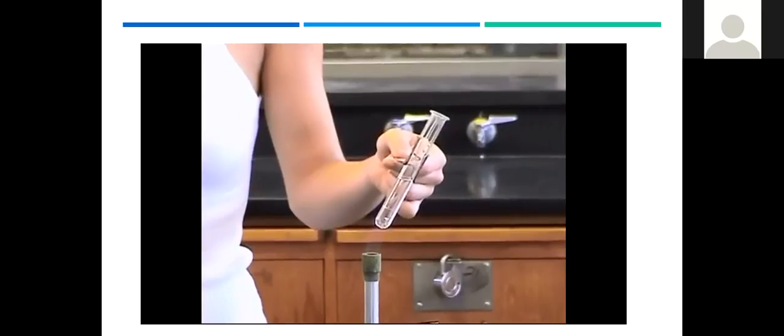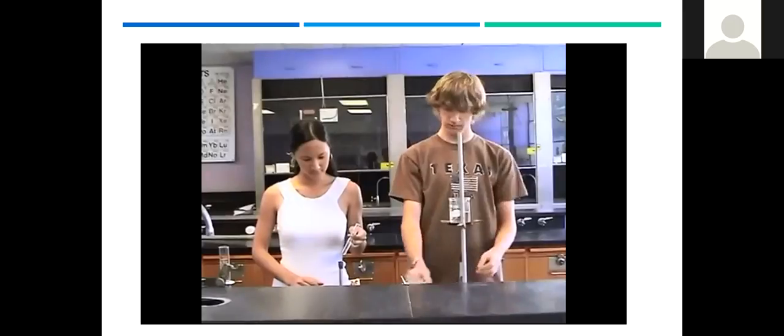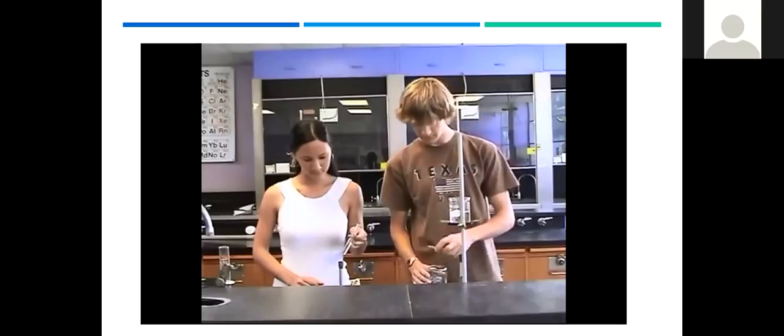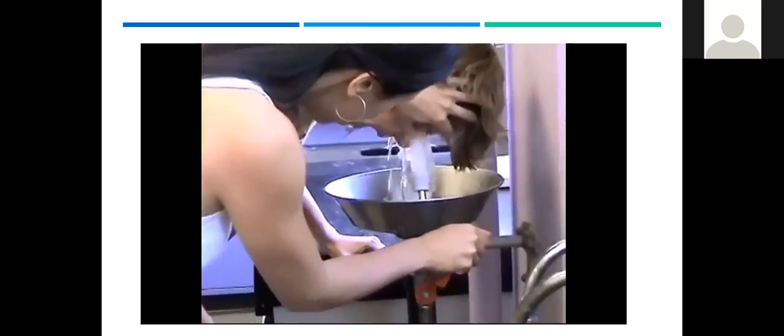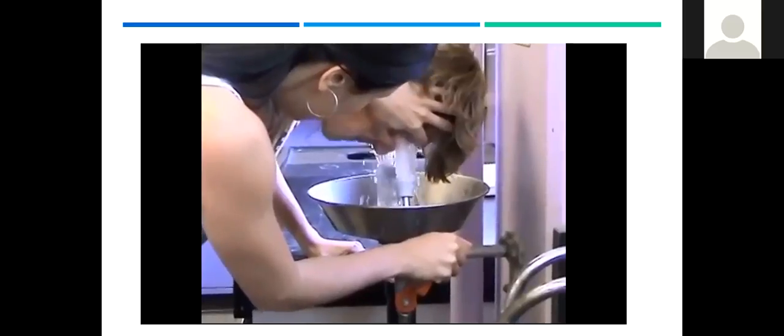Notice the student on the left is applying a strong flame to a test tube containing a liquid. Because the test tube is not being heated evenly and gently and is also being carelessly held, the contents can easily be bumped from the test tube, perhaps into a neighbor's eyes. It is critical to get the victim to the eyewash station or a sink immediately. Because the eyes must be flushed thoroughly, it is necessary to keep the eyes pried open. You should report the incident to your instructor immediately.